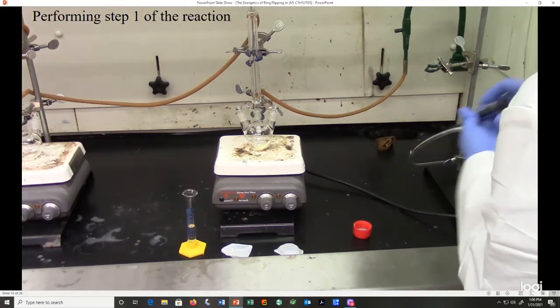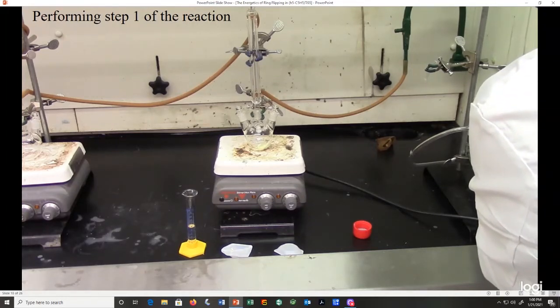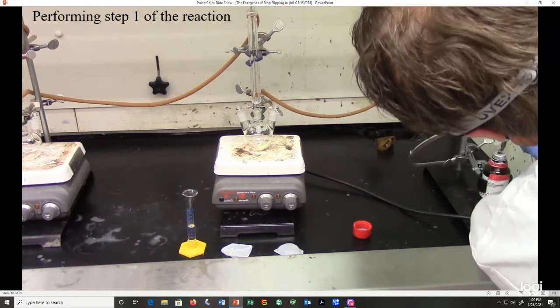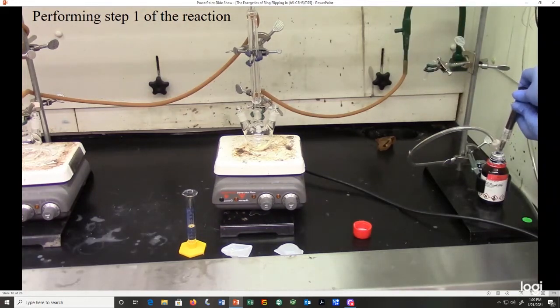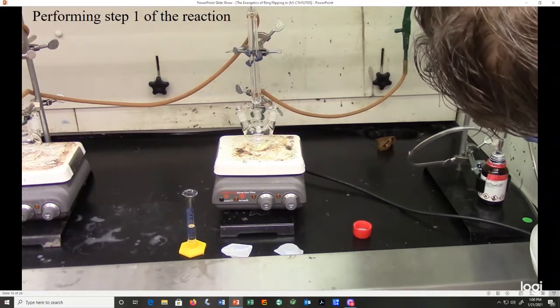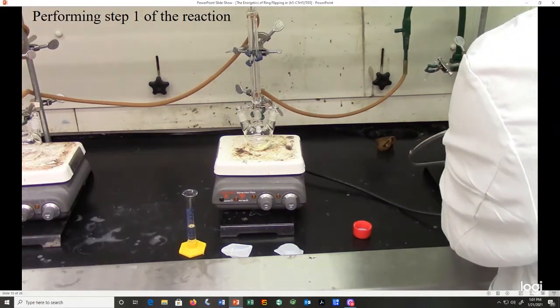So after doing that 3 times, now we're going to push the needle down to below the level of the liquid, and we're going to draw up 4 milliliters, and put that into our reaction flask. And you'll see that we're going to get an instant reaction and a lot of hydrogen gas being liberated.